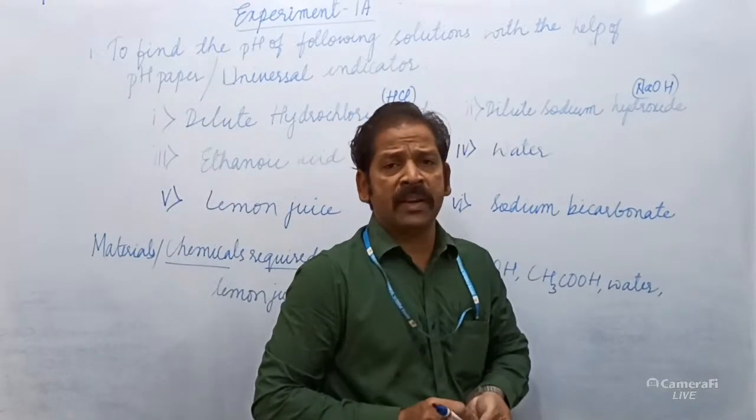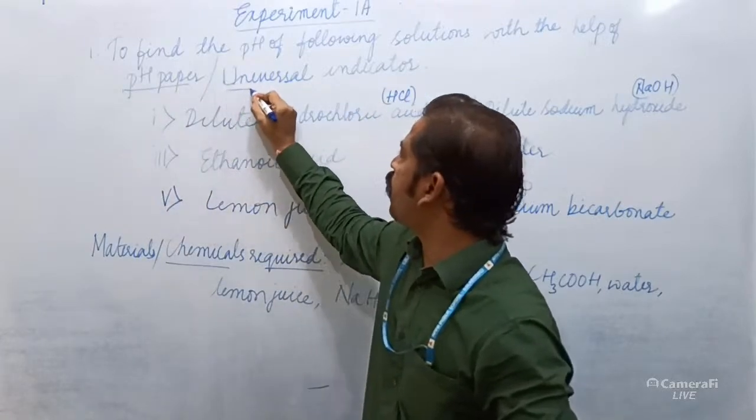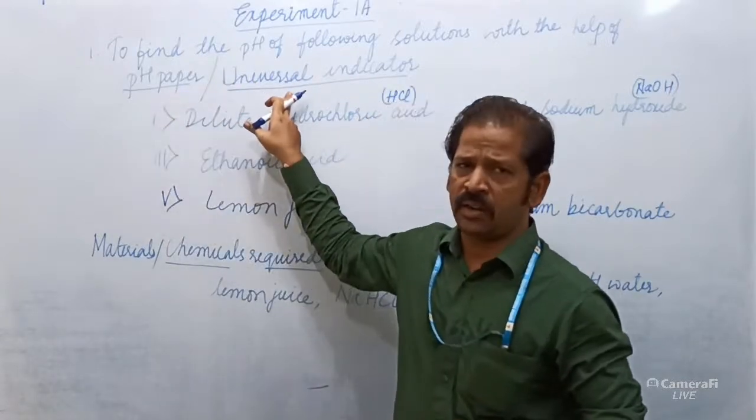Apart from that, out of pH paper or universal indicator, you have to take any one. It is a paper actually, it is a chemical.